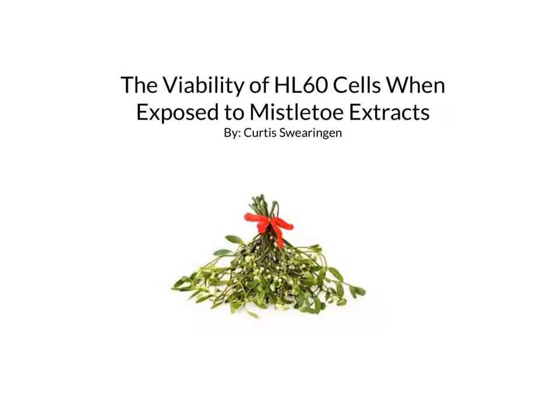In the experiment for the viability of HL60 cells when exposed to mistletoe extracts, the goal was to find a vascular or non-vascular plant extract that can induce apoptosis onto HL60 cancerous cells. Research was done to find that mistletoe has been studied and found to be a great inducer of apoptosis in cancer cells. In fact, in Europe, mistletoe extract is among the most prescribed drugs for patients with cancer, but the FDA has yet to approve mistletoe as a treatment for cancer.